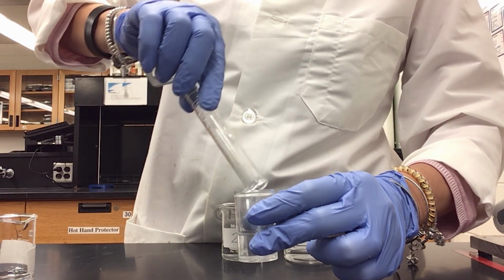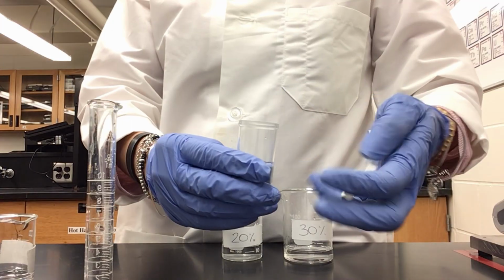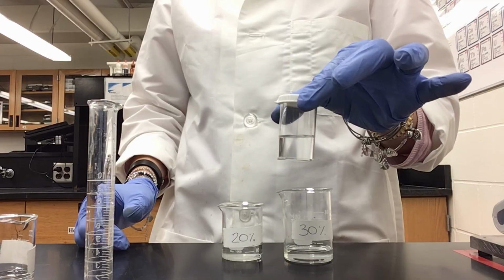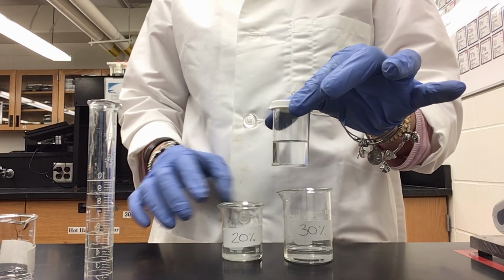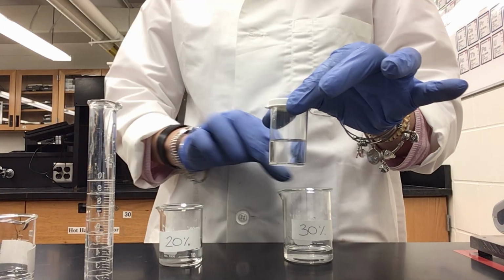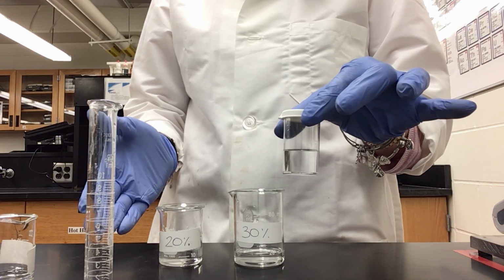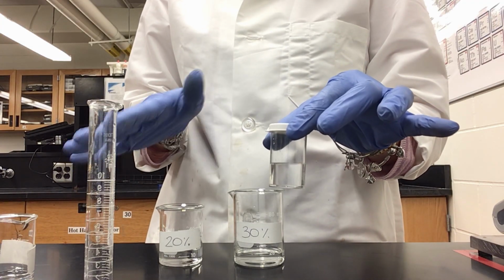There we go. So now I can cap it, go to the balance and measure its weight. And then do the same thing for the 20% and the 30%. Now I'm gonna do it, and then I will show you the data.